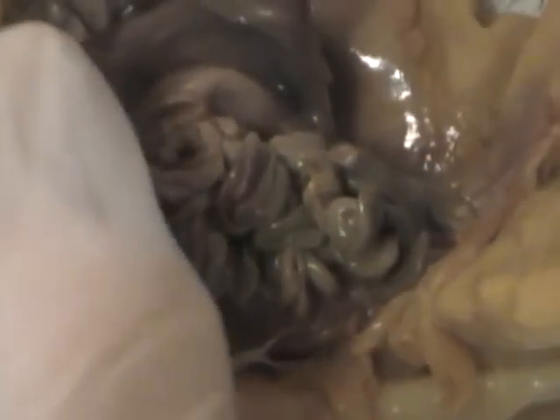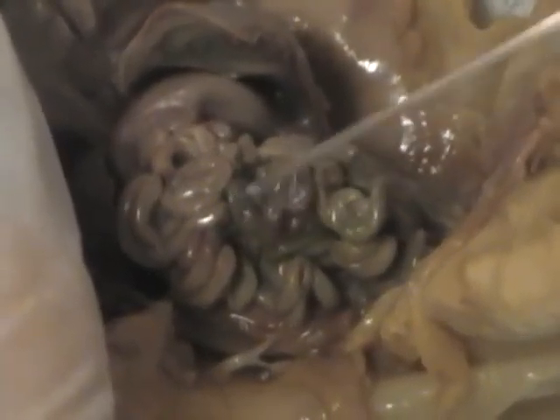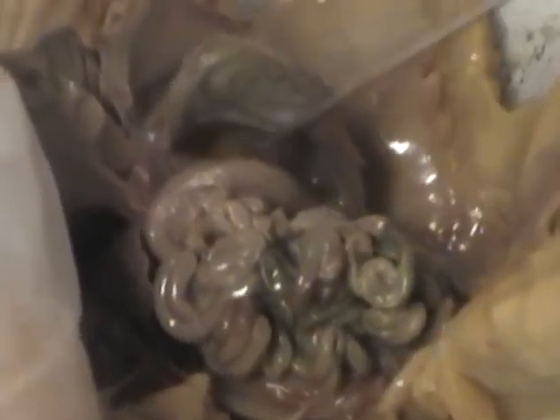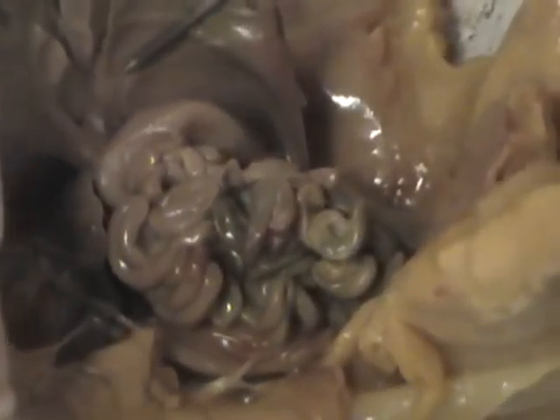So that right there is the gallbladder, and that stores bile. This whole thing is the liver, which creates the bile, which then goes into the small intestine, which is all this stuff, to help aid with digestion. Here's the stomach. It's deflated since it hasn't really eaten anything. That's just another part of the liver, I think.